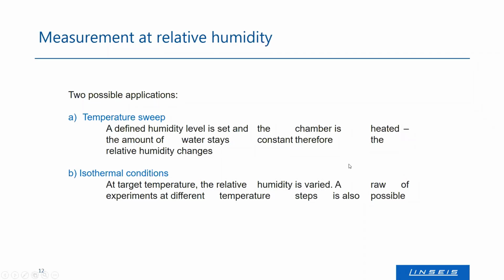So this would also be possible, and this is what most people do. What would be possible, but what is very difficult, is to increase temperature and try to keep the humidity level constant, because this would require always pumping more and more water in. That can be done. However, during cooling, that always leads to condensation of the water, and that means a lot of liquid water in the instrument, which is not so good.